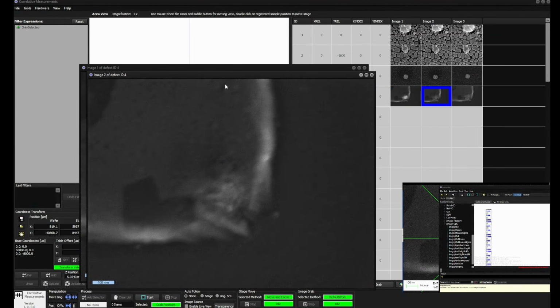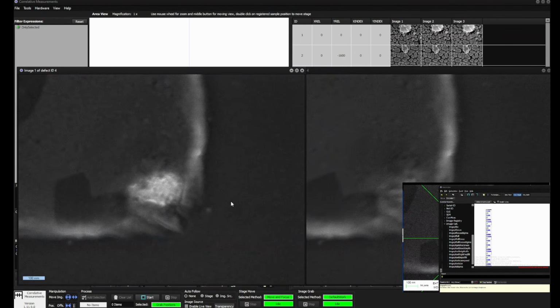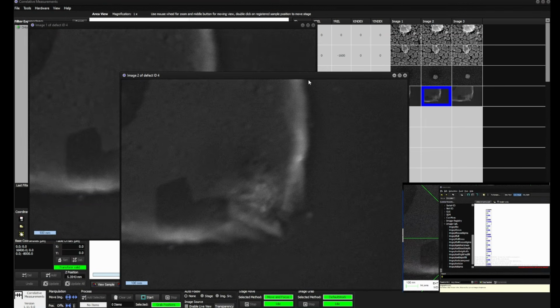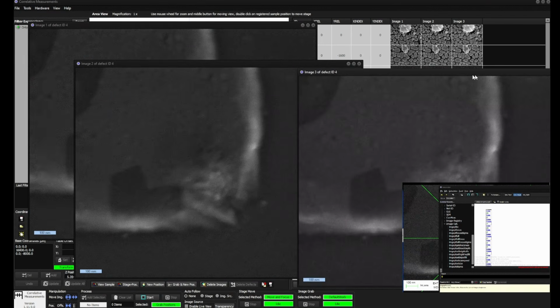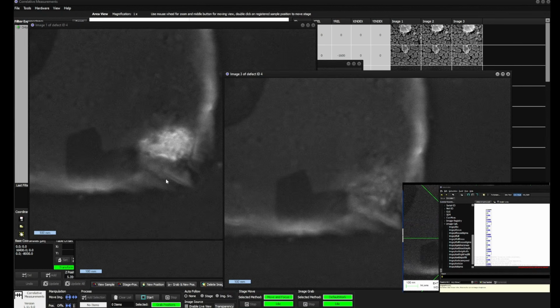And here we have a change of the surface, this material seems to be more sensitive, but you can see that the overall quality is much better. You can see here the double line where you only can see the first line. But anyway, in comparison, this one was even better than the second one with the focusing, but this is still the best.